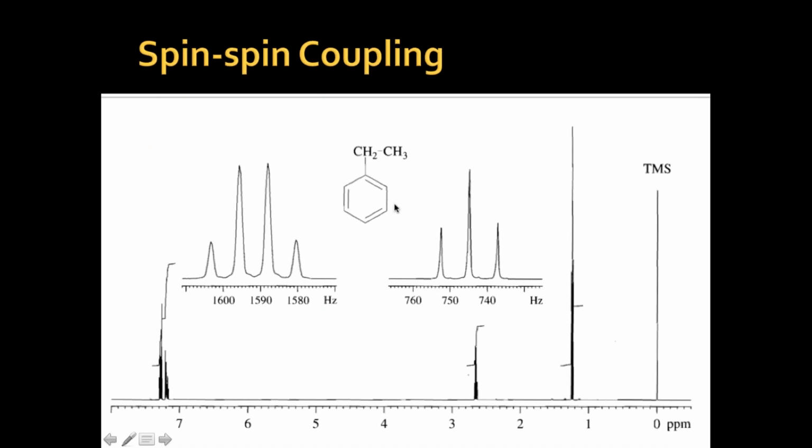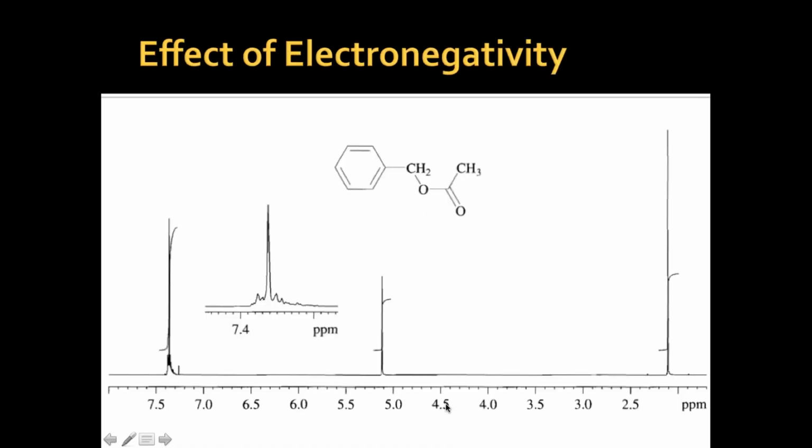That's the reason it shifted the peak towards upfield. Upfield means towards the lower number. Lower number means, you see, 2.6 or 2.7. There it was around 5 point something. It was downfield. I'm telling again and again downfield and upfield because these terms are very important to remember.